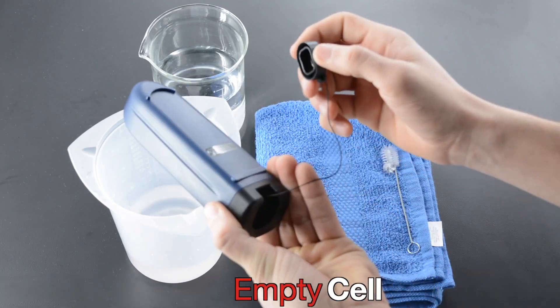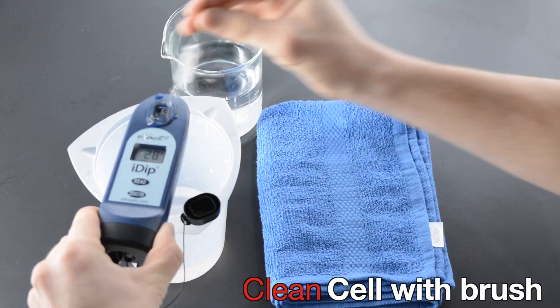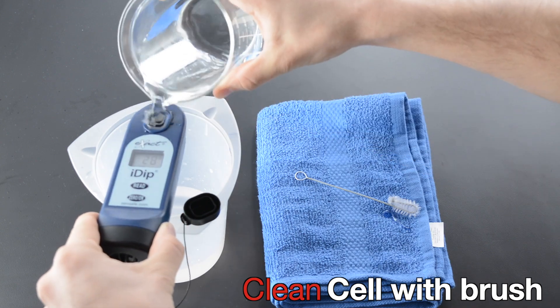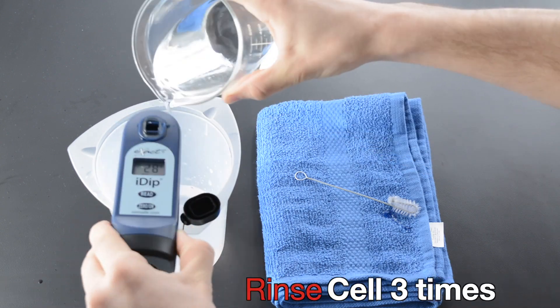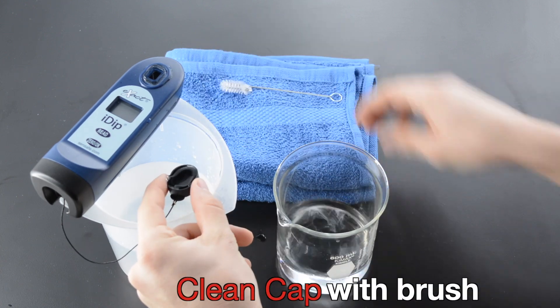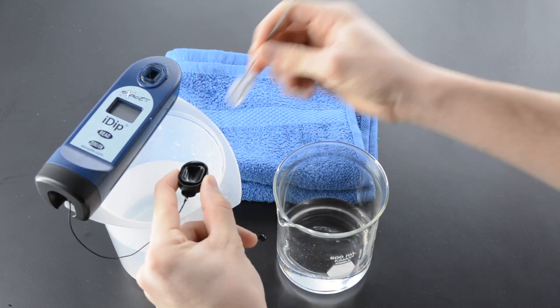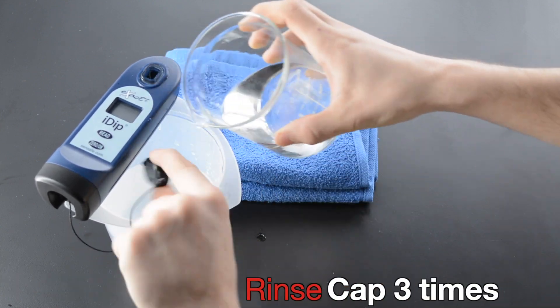Empty the cell. Clean the cell with a brush. Rinse the cell three times. Clean the cap with a brush. Rinse the cap three times.